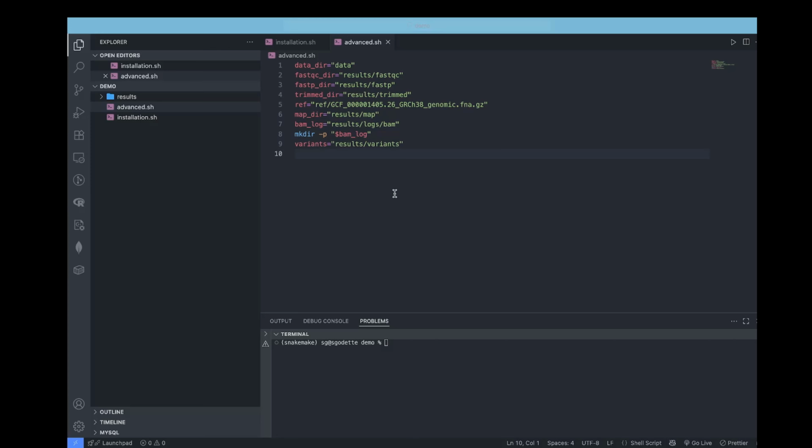So the easiest way to do this is first of all to set an empty array that we can call accessions. Set it to an empty array, and then have a file where we store the accession numbers. So the accession numbers are currently stored in the GitHub repo in the file called srr-sec-list.txt. So I will simply go and copy those accession numbers, store them in a separate file, and then provide the path to that file in my bash script.